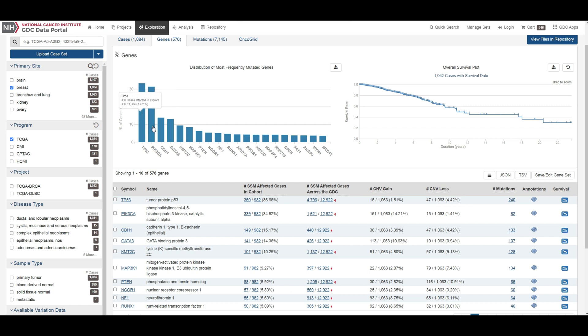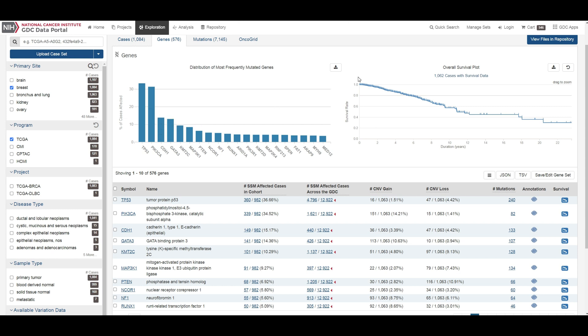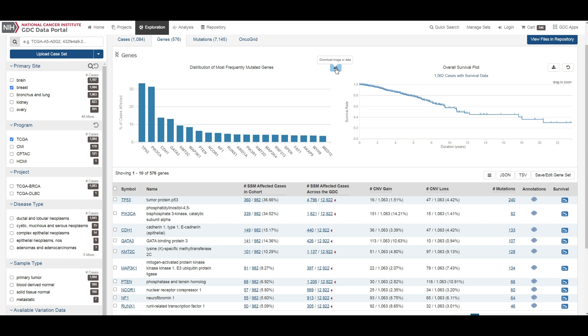Hovering over each bar in the plot will display information about the percentage of cases affected. In addition, this section contains a survival curve. The survival curve is calculated using the Kaplan-Meier estimator based on all cases with survival data within the specified exploration page search. Users may choose to download the underlying data in JSON or TSV format, or an image of the graph in SVG or PNG format by clicking the download icon at the top of each graph.